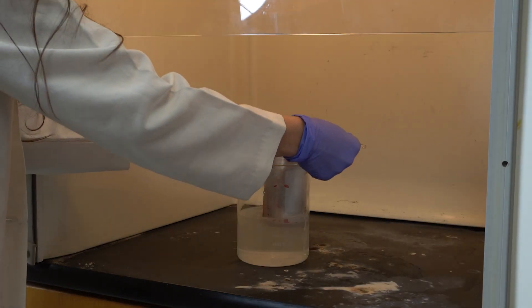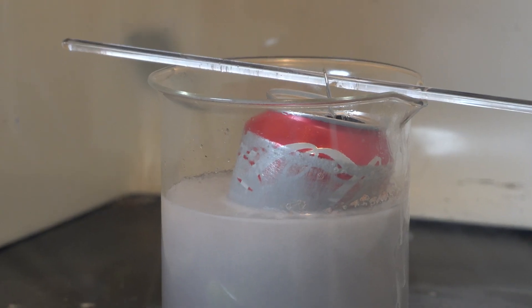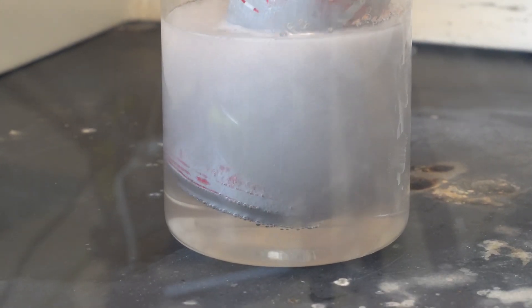When we add the aluminum can, it instantly reacts with the sodium hydroxide solution, forming sodium aluminate and hydrogen gas. This might take a while, so let's speed things up.